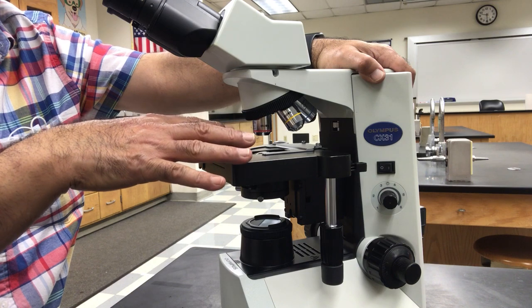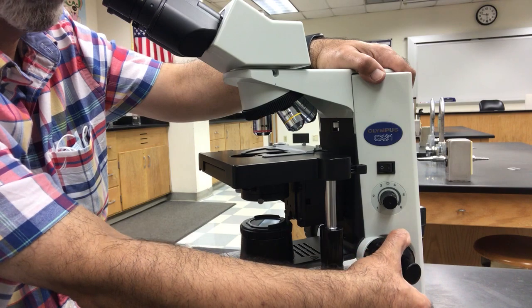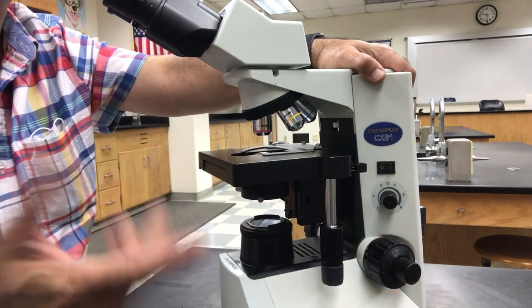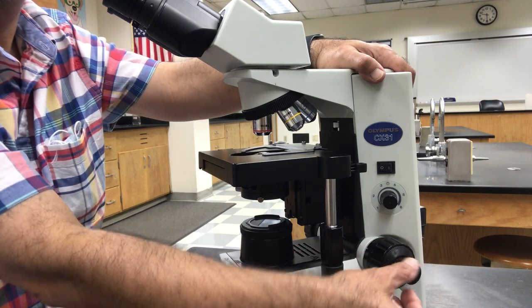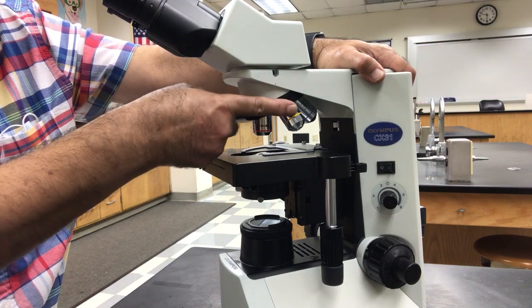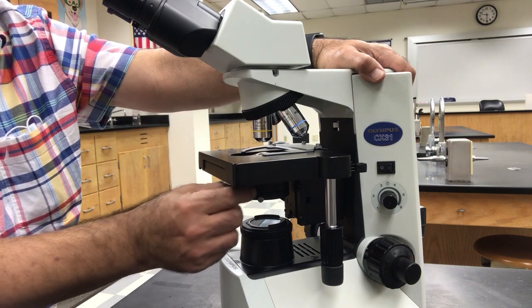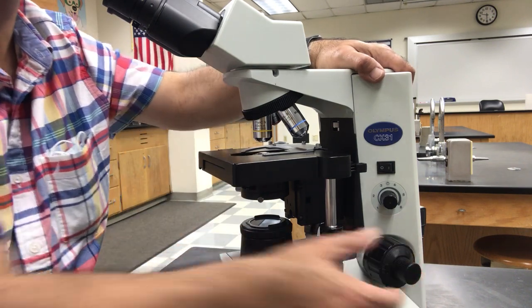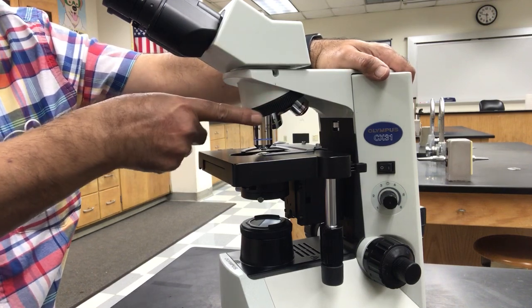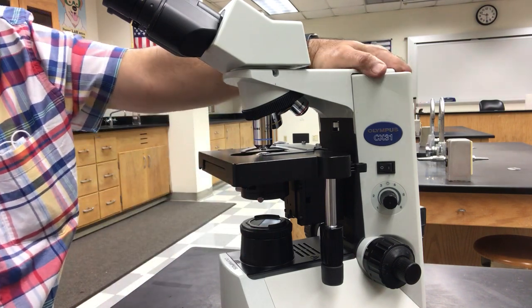Once you have focused the object, by moving this, as you can see, if you move the coarse focus knob towards you, it lowers the stage a little, just a little move, and you would see the object. And then you would fine focus it to make it clearer. And when you are ready, you would move the nose piece to get into the next one. A little bit of light adjustment, a little bit of fine focusing, and you would see the object even bigger. And then finally, you would have gone to the high power and then see the largest possible with this microscope.